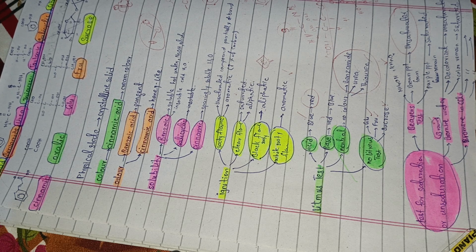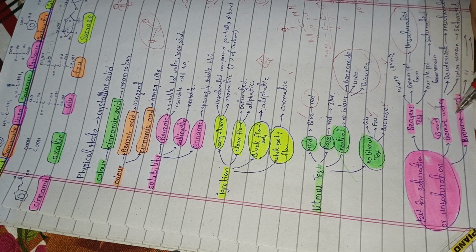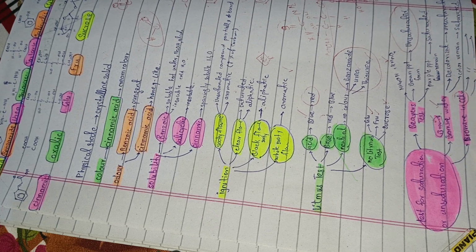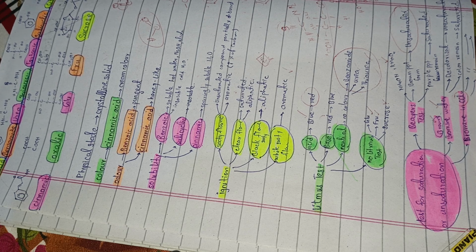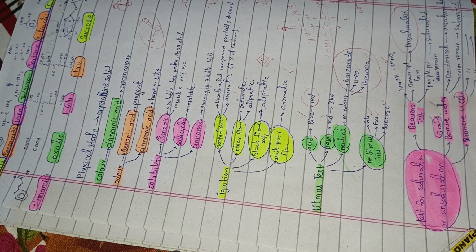Okay. And now one of the most important things I have to tell you is why we take bromine water and then also take bromine in CCl4. Why don't we use bromine water again? Because we have two types of compound. Keep it in mind. First, compounds which are soluble in water, and second, compounds which are insoluble in water.